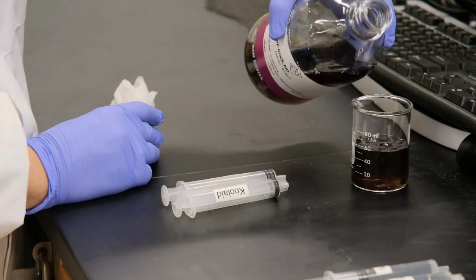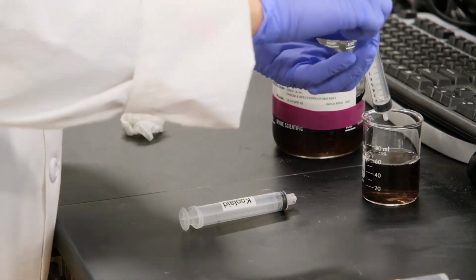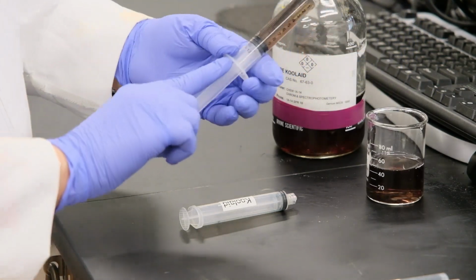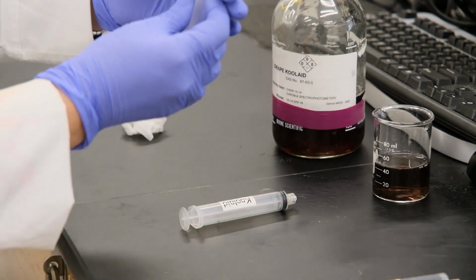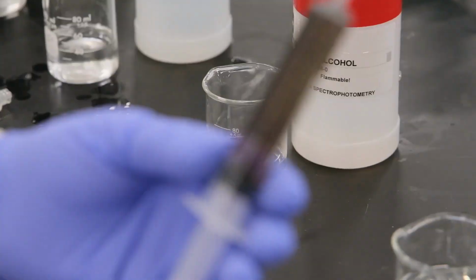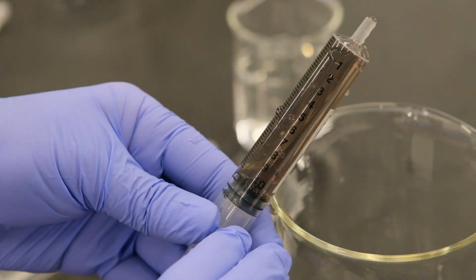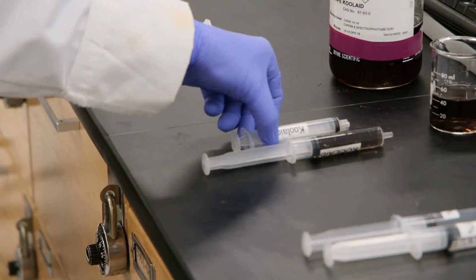We collect also for the Kool-Aid 10 milliliters. We go above the 10 milliliters, as we did earlier. And then in our waste, here is the mark for 10 milliliters. First we flick to eliminate every bubble, and then we push the piston so that the upper part is on the 10 milliliters. And we do this for both times.